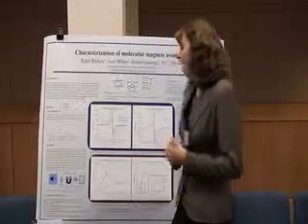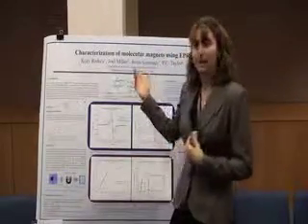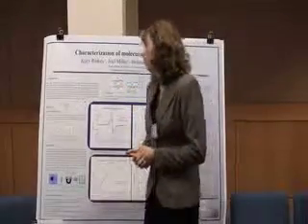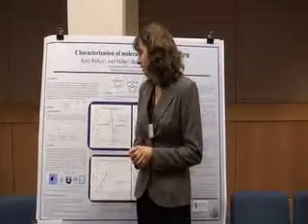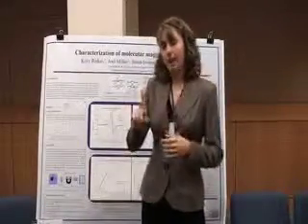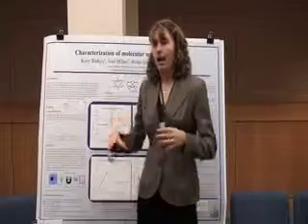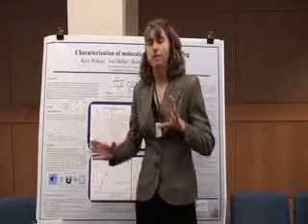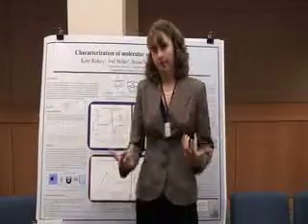For my experiment, I characterized my molecular magnets using ESR, or EPR. EPR is electron paramagnetic resonance, and it measures the energy difference between a spin up state and a spin down state, and uses that energy difference to cause an absorbance.